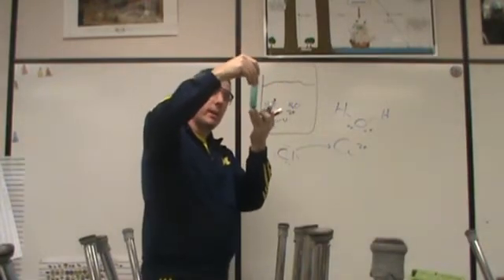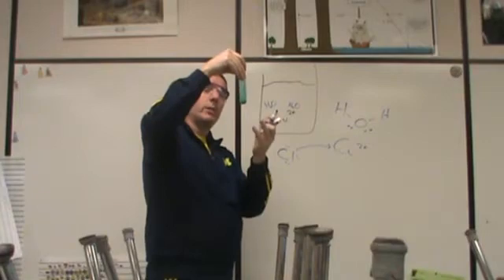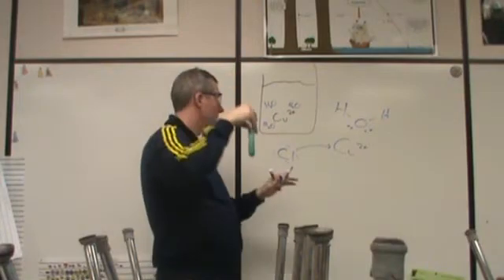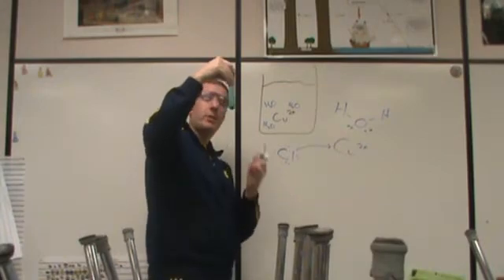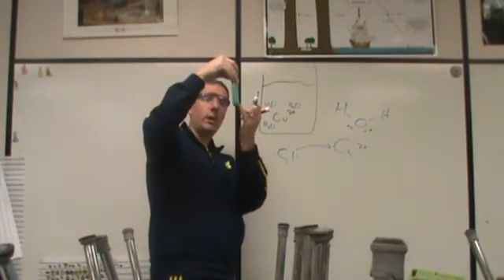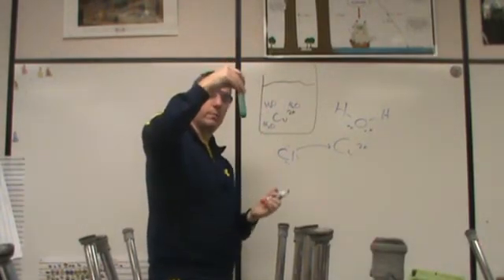As I let this mix and stir, they're often going to get replaced by water because there's a lot more water molecules in here than there are chloride. So as that happens, you're going to see this green start to fade and it's going to turn into just the blue.